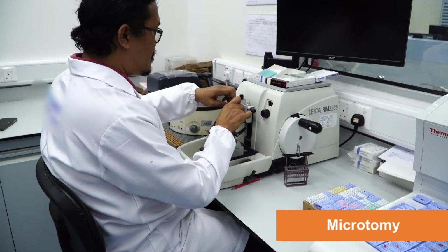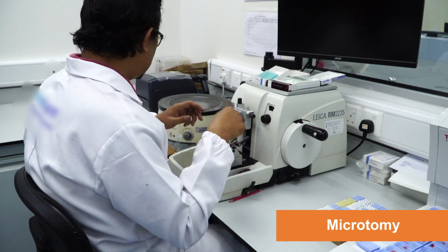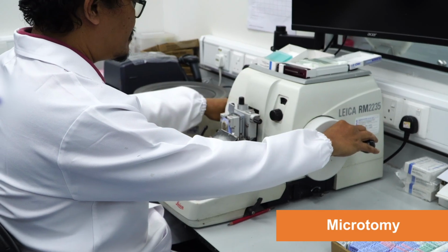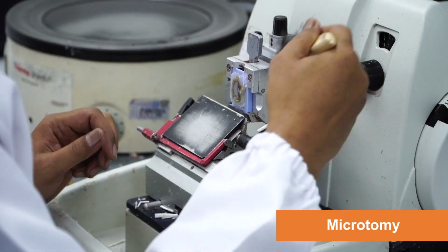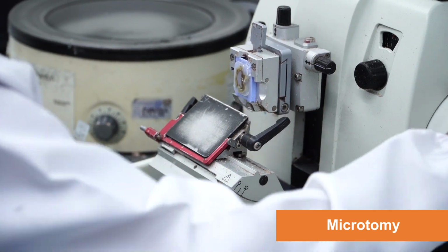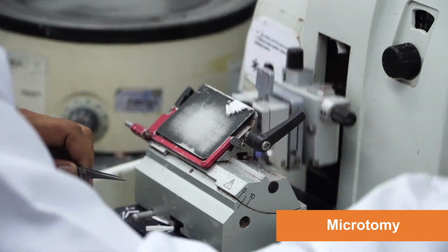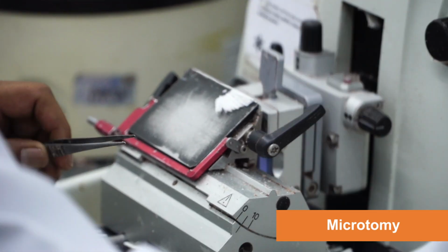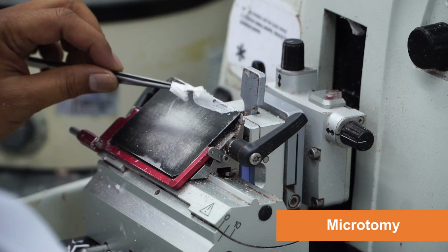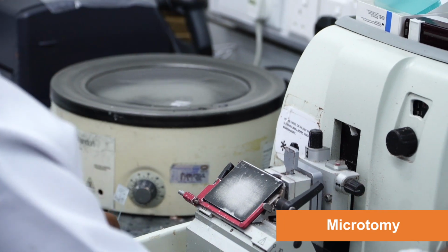A microtome is used for cutting thin tissue sections for microscopic examination, known as microtomy or sectioning. After cutting, tissues are floated on a warm water bath to eliminate wrinkles and distortion, then transferred to slides. This intermediate step allows tissues to relax and adhere to the slides. Water baths are heated slightly below the paraffin melting point, typically at 40 to 50 degrees Celsius. The goal of microtomy is to produce artifact-free slides for histological analysis.